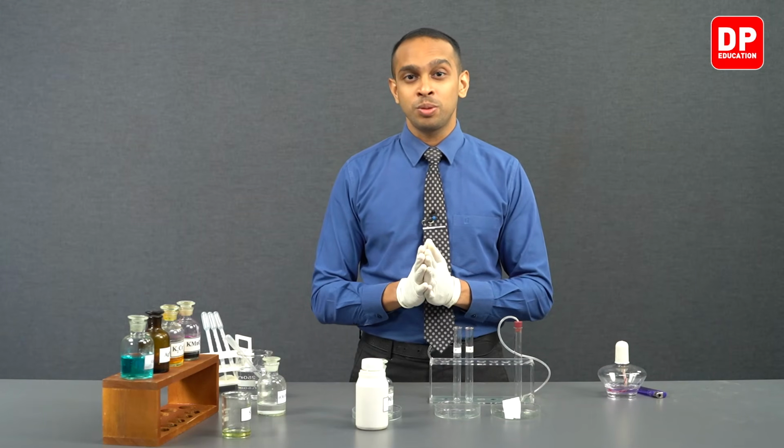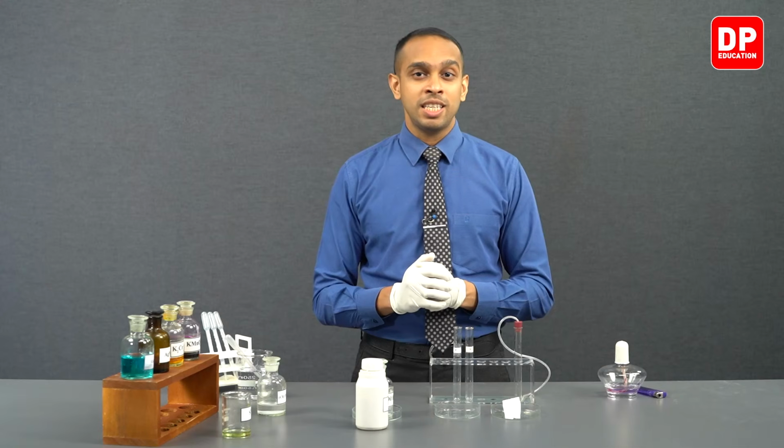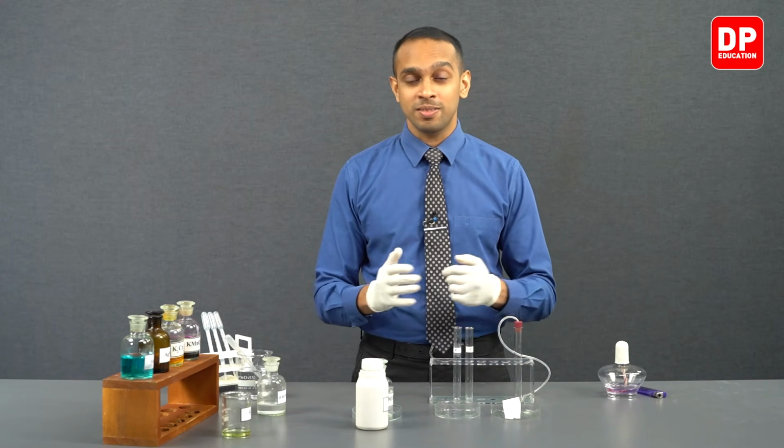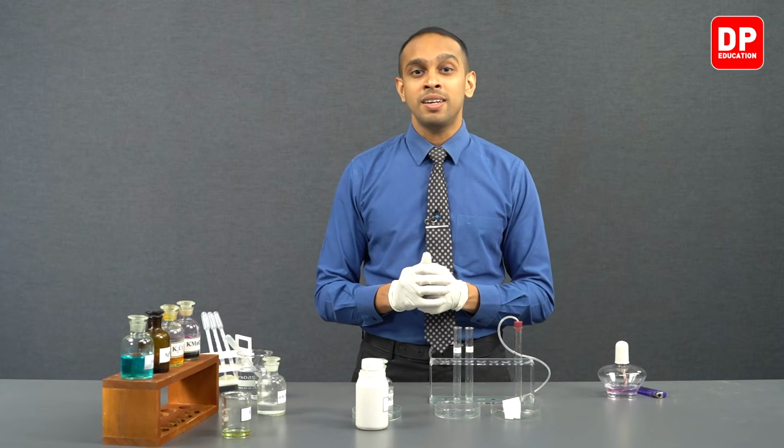However, when it comes to hydrogen sulfide, it is not as toxic as sulfur dioxide, but still it is going to be an irritating gas. Hydrogen sulfide has a very characteristic smell of rotten eggs. So you can very clearly identify that hydrogen sulfide is formed by its smell. It smells exactly like rotten eggs.